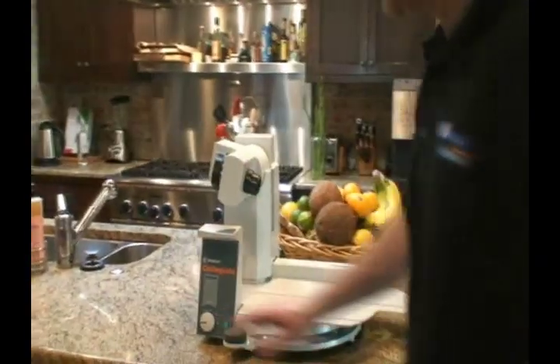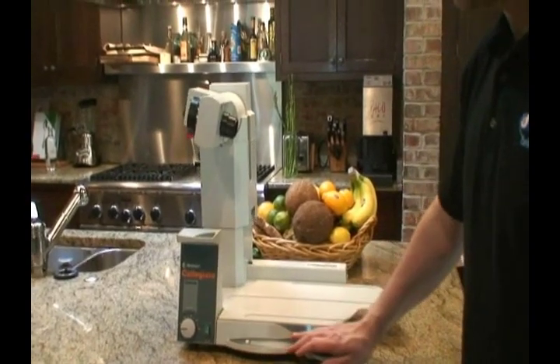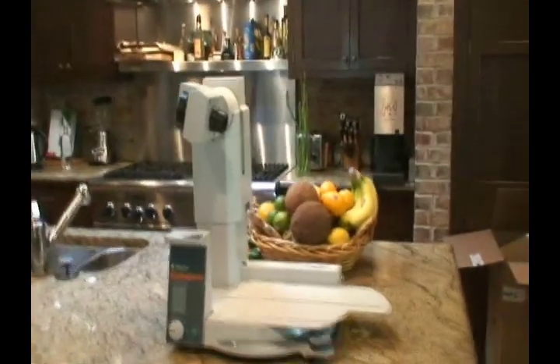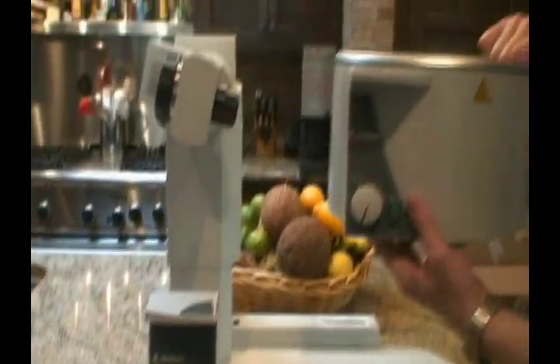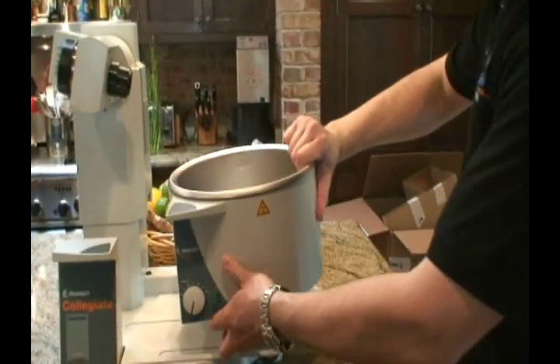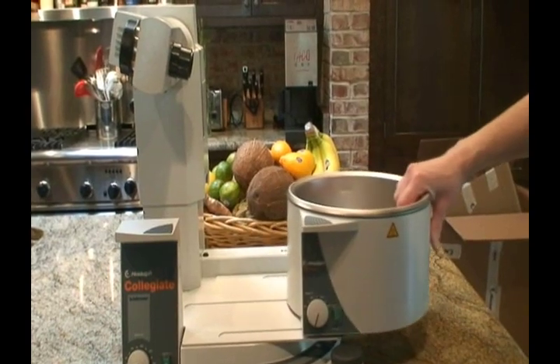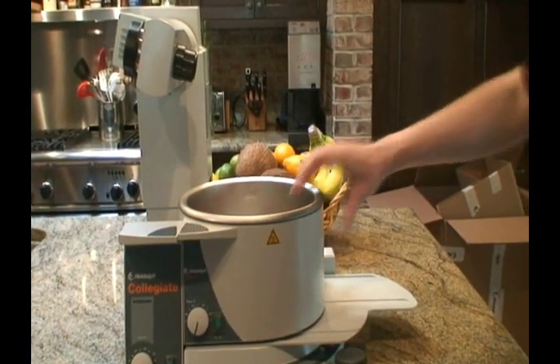We've just got my new Heidolf Rotary Vacuum Evaporator, and we're going to go through the installation and setup. This is the drive unit, with variable speed of the drive, and the heated bath that will warm the flask.